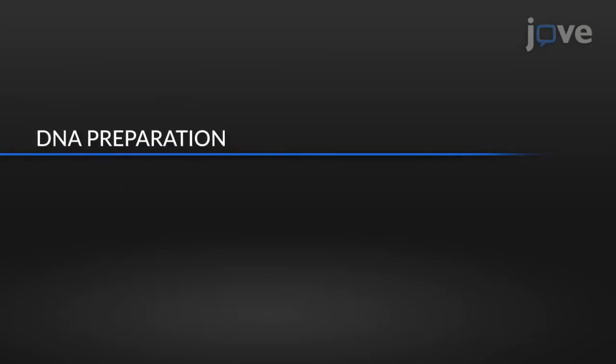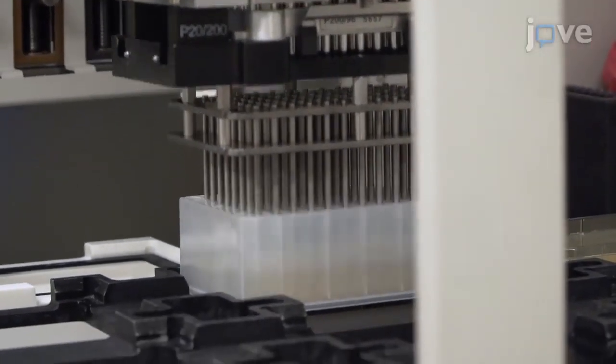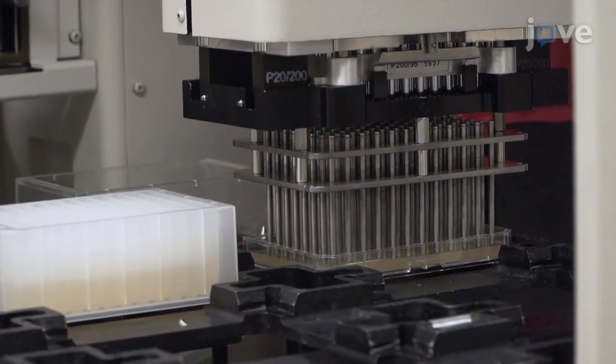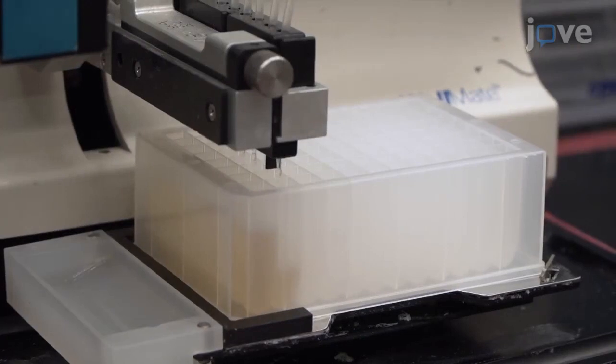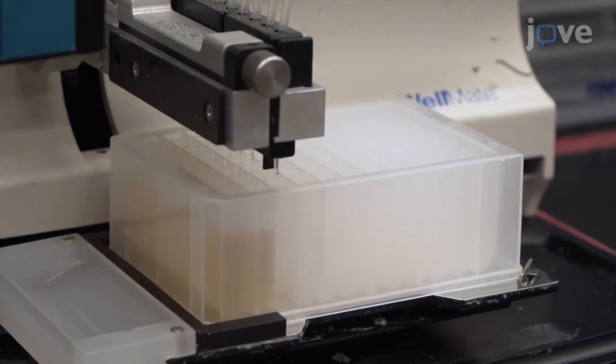To prepare bacterial growth for in-house high-throughput mini-prep, first, inoculate the bacteria in the agar plate in a 96-well format and let it grow for 16 hours. The next day, fill each well of a deep well plate with 1.5 milliliters of terrific broth medium supplemented with antibiotic, ampicillin. The antibiotic depends on the selection marker on the plasmid.